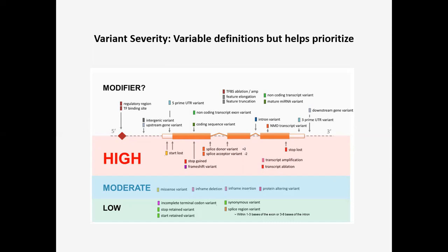So suppose you could see variation in different genes, but these genes are not involved in those phenotypes, so then they cannot be a culprit for that particular variation or the disease production in your sample. So that also you have to take care.